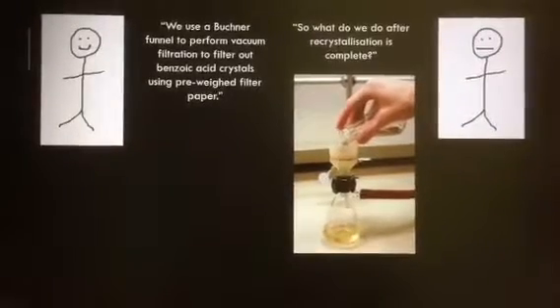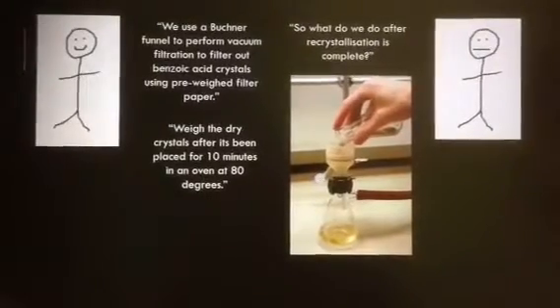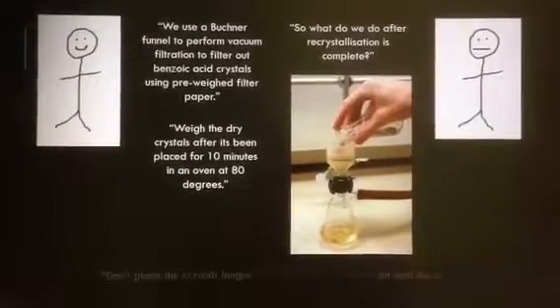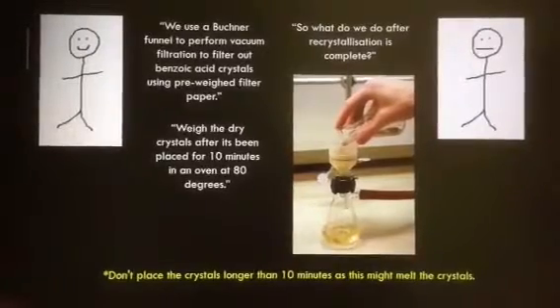So what do we do after the recrystallization is complete? Weigh the dry crystals after they've been placed for 10 minutes in an oven at 80 degrees. Don't place the crystals longer than 10 minutes, as this might melt the crystals.